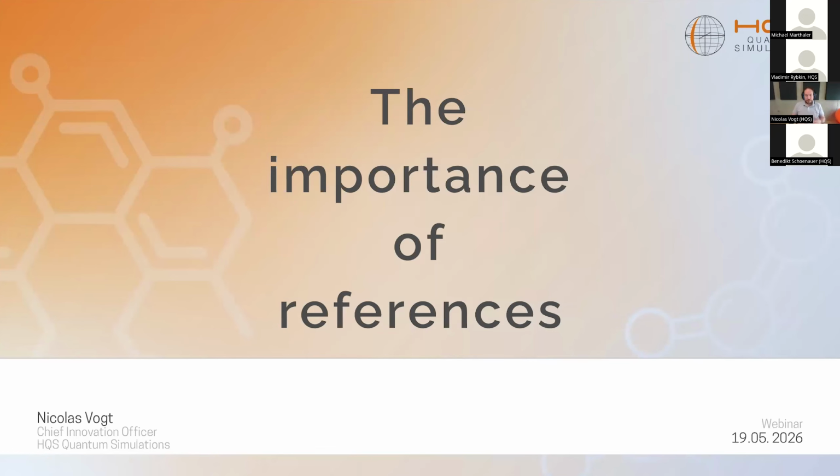And before we use the rest of this webinar to discuss the more technically challenging and interesting aspects of mixture analysis and a more complicated example from Michael, I would like to take a step back and talk to you about the importance of references, what references actually are, physical and digital references, and how they are related to this extraction of parameters, this parameterization that Michael already introduced before.